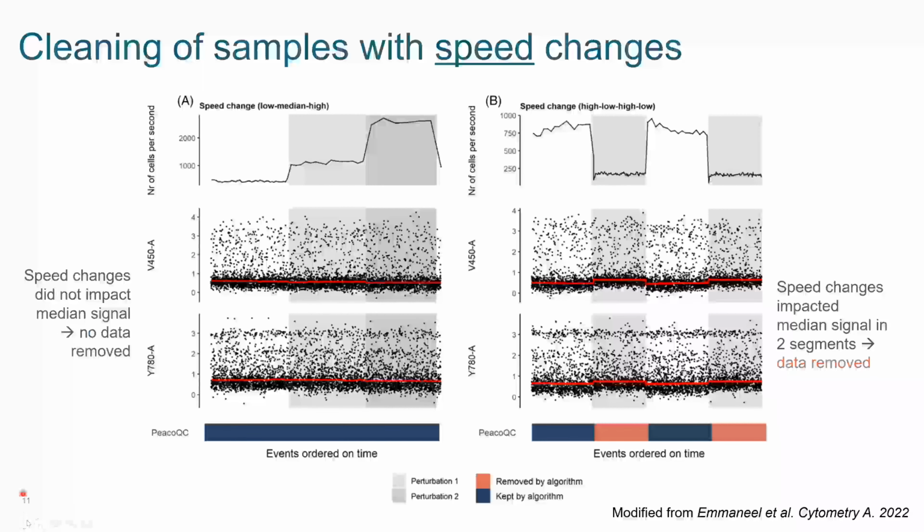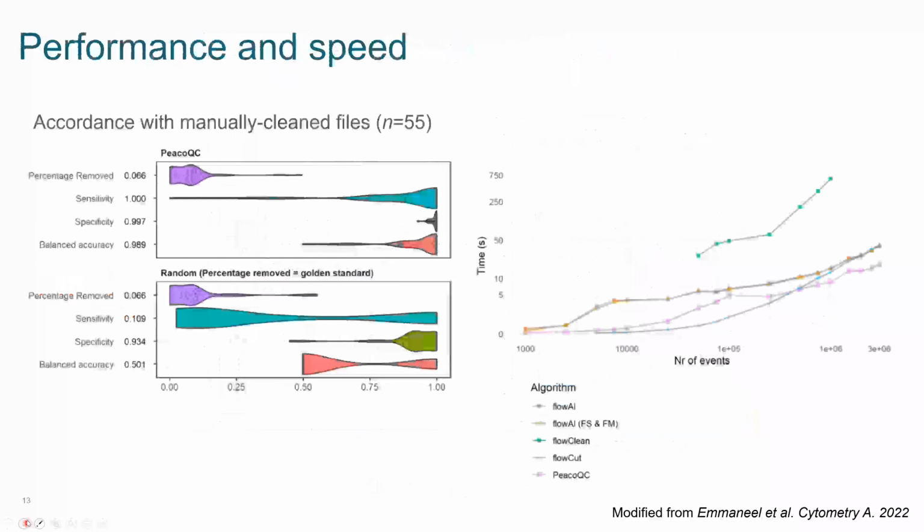All right, so let's see, I'm going to go ahead and move on. Okay, I think we covered that slide. And so let's talk a little about performance and speed, right? So how did this tool perform against, say, a manual inspection?